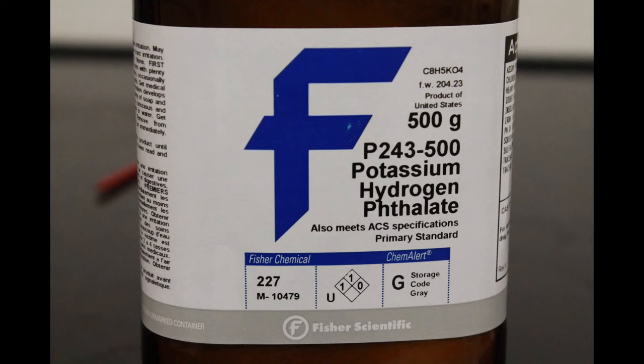Now we are ready to find the mass of our KHP. KHP stands for Potassium Hydrogen Phthalate and will react with NaOH in a 1 to 1 mole ratio. Note the formula weight of KHP here on the bottle. You will need this mass for your calculations as well.